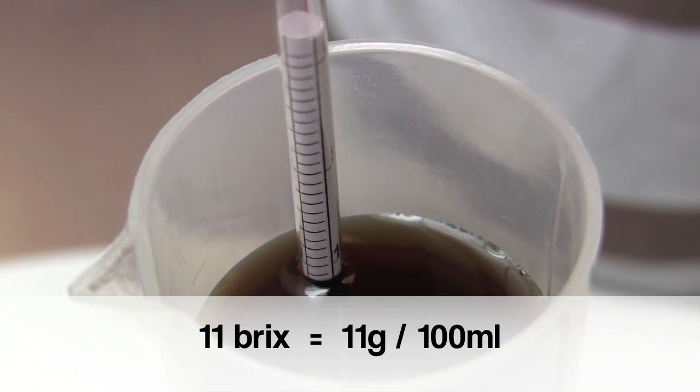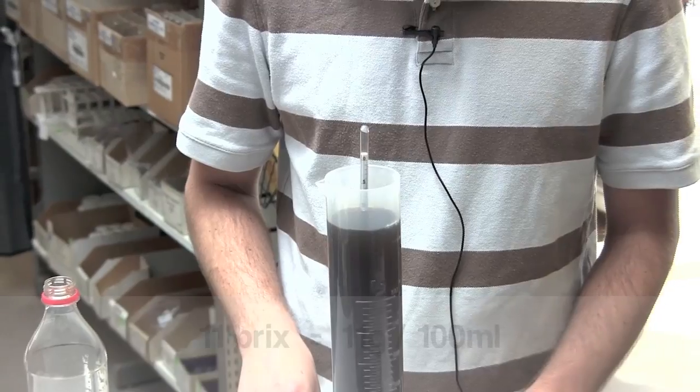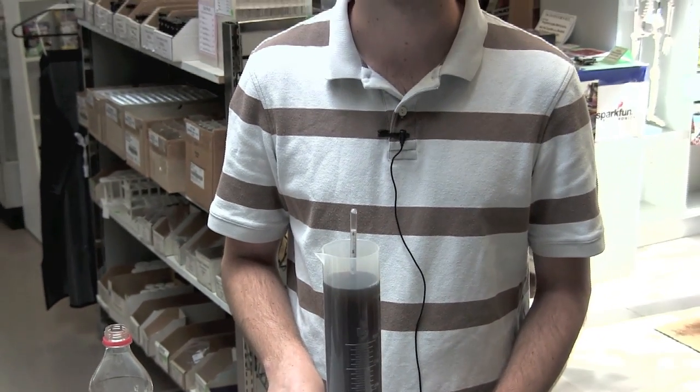11 is the amount of sugar in grams per 100 milliliters of your beverage. Finally you can use the following formula to calculate the total amount of sugar in your beverage.